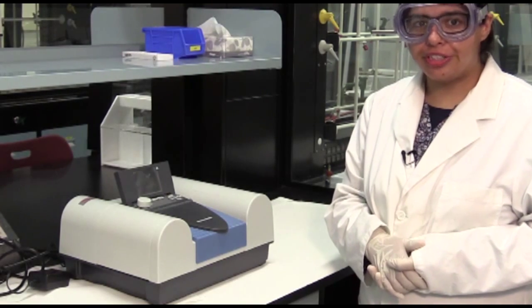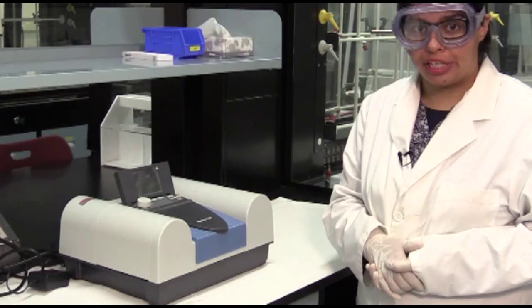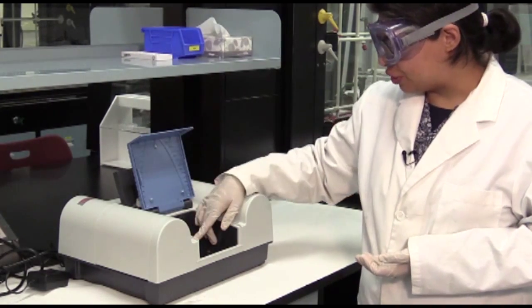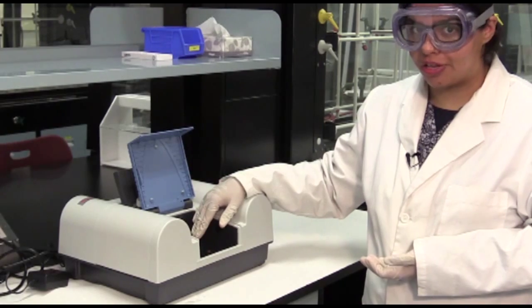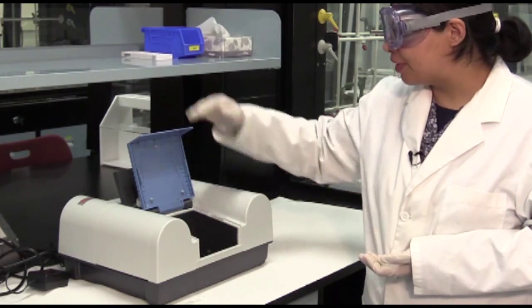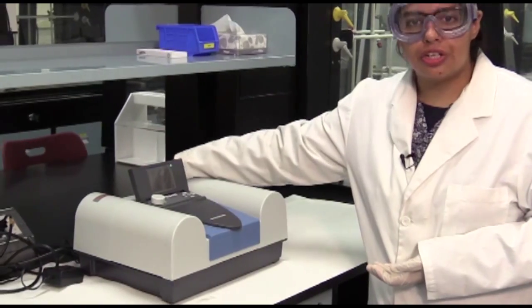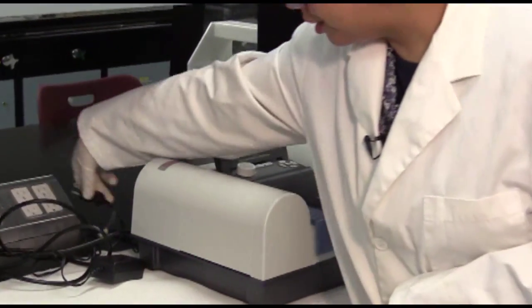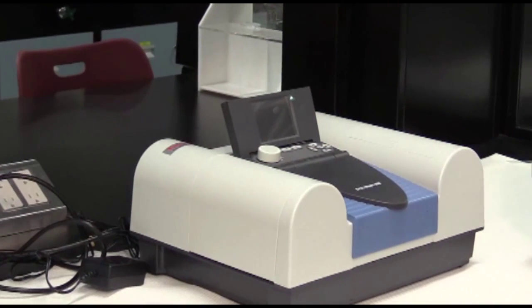When you are done for the day, make sure you shut the instrument off properly. First of all, open the compartment, and make sure that you have no cuvette and no sample on the inside of the compartment. Close the compartment, turn the instrument off from the back, and pull the plug out. And that's the shutdown procedure.